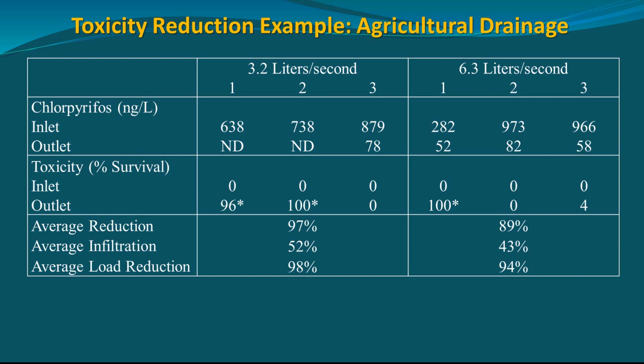even though it's not used as much in agriculture these days, it still is used in certain applications, and it's one of those pesticides that's kind of moderately soluble. So the ones that are sticky, that are really hydrophobic, like pyrethroids, are the easiest ones to remove. Chlorpyrifos is sort of in the intermediate range, so it's not the easiest one to remove. So it provides a good example for testing one of these systems.